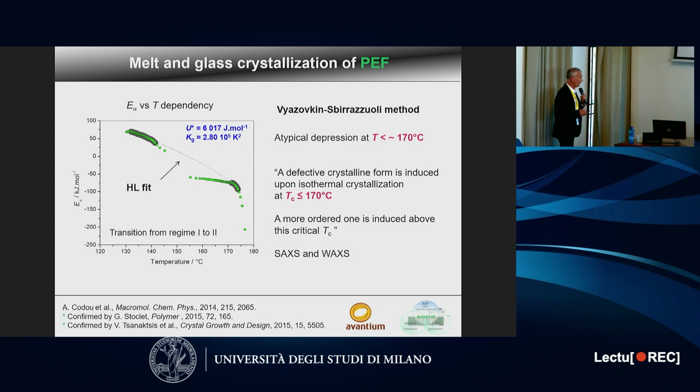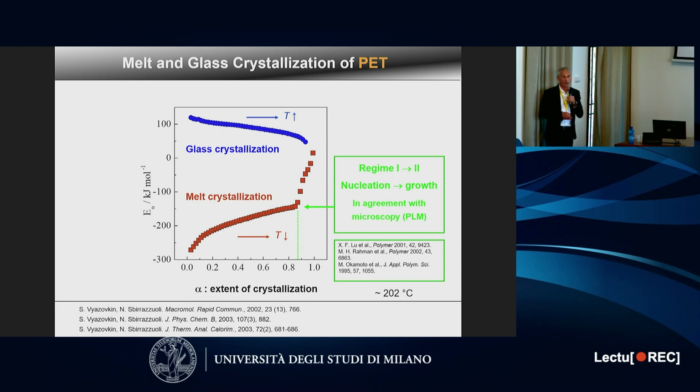And this was confirmed later by different authors who made much more sophisticated measurements with SAXS and WAXS. So this is a proof of the validity of our simple computations. And now if we come back to PET, at that time we observed a change, a break here at 200 degrees.